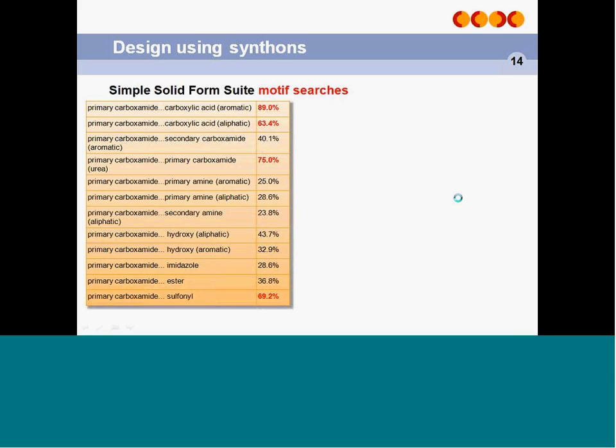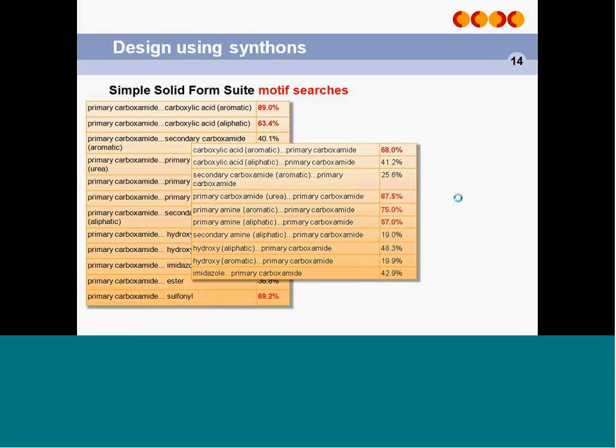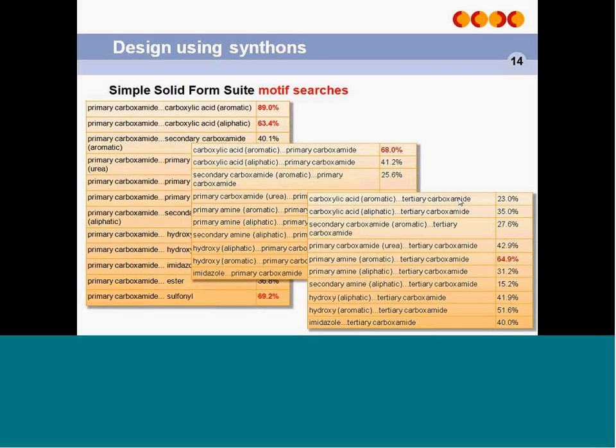So when we're looking at the 22 co-formers that the study used for that screening method, and I don't want you to look at the specific numbers too much, what we're showing here is essentially results of motif searches on every pair of functional groups from a coformer to the target molecule. And we have 3 sets of data showing the coformers as acceptors or as donors to either of the 2 piracetam molecules. So what we can see from these results is that a certain few of the pairs of functional groups are highlighted in red, and these are the ones where the frequency of occurrence is higher or approximately the same as the pure motifs. So essentially, these are the heterosynthons that are competitive with the piracetam pure forms.